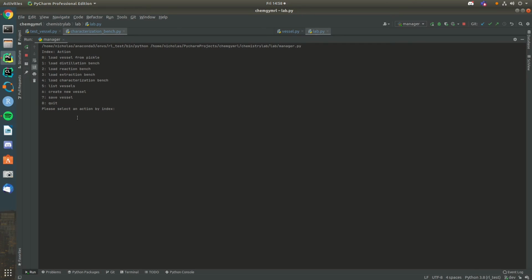As an agent goes through this environment, it will be trying to isolate a certain material and identify it using these benches and the characterization bench. To do so, let's give a brief view of some of the features that an agent might use. This environment is set up at the moment as a way to use pre-trained models. There are ways where you can train your own models, and we will have tutorials showing you how to do that.